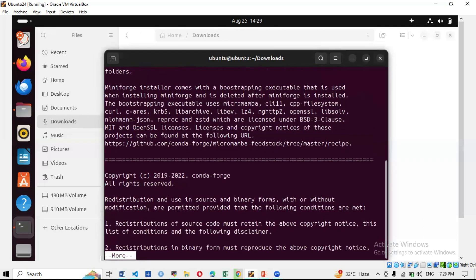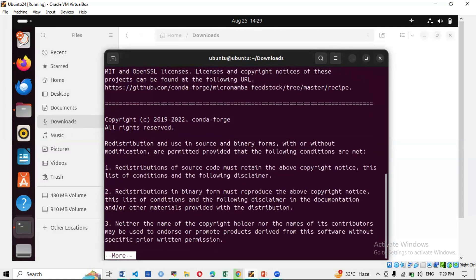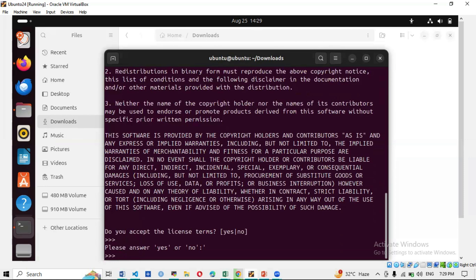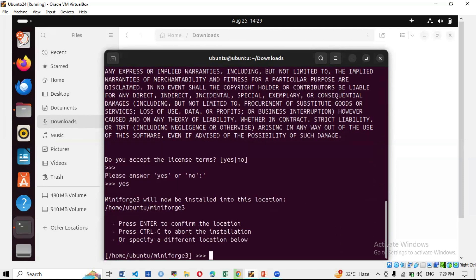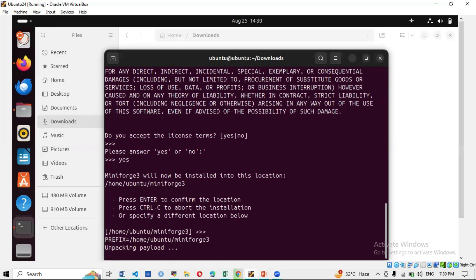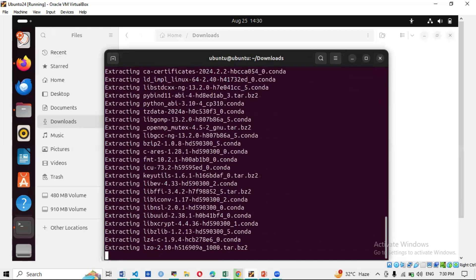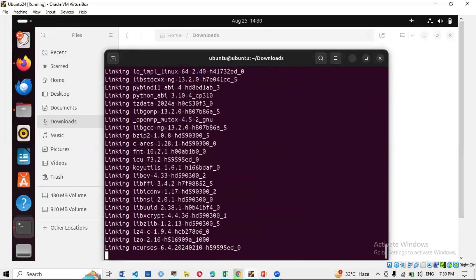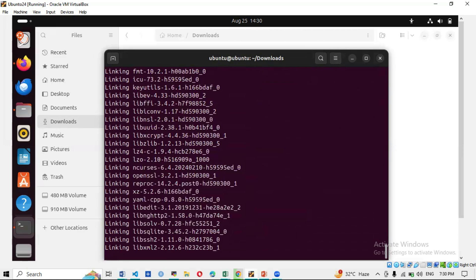Continue reading through the script/license. When asked 'Do you accept the license terms?' type 'yes' and press Enter. It will tell you Miniforge will be installed at the location: /home/ubuntu/miniforge3 — you can change this, but the default is fine. Press Enter and the installation will start, unpacking and extracting files. This takes a little time.